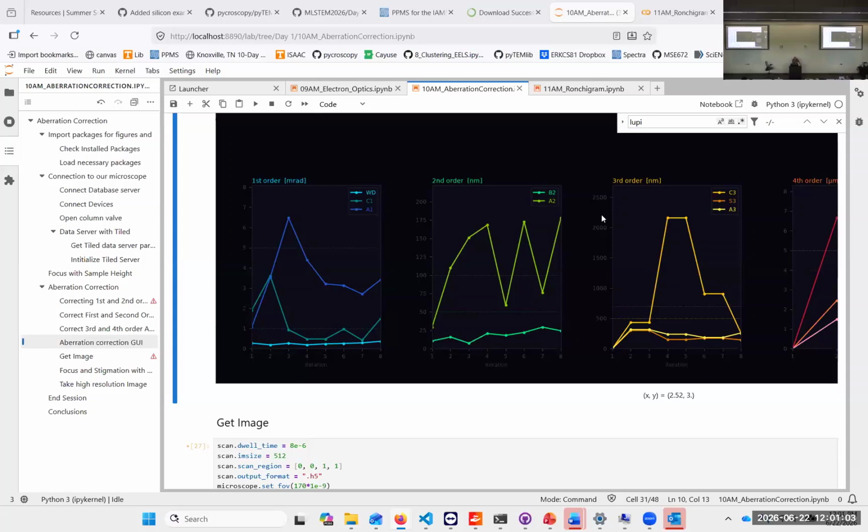Could you, there are two condenser stigmations on microscope. So one stigmation, actually there are three stigmators on there. So there is the condenser stigmator.